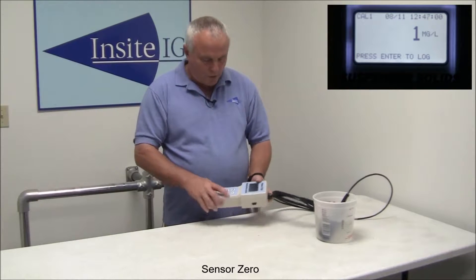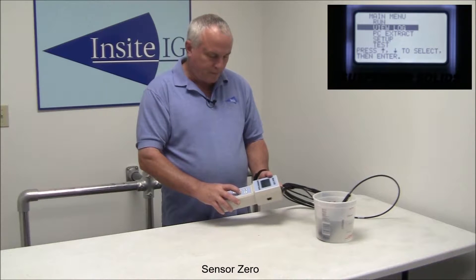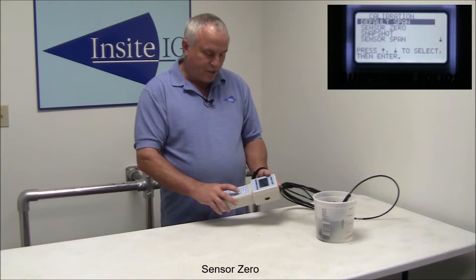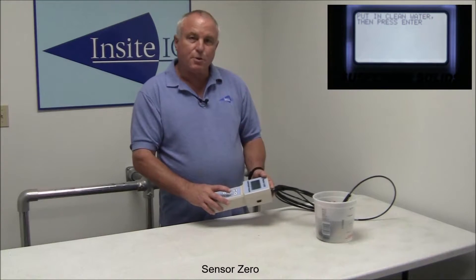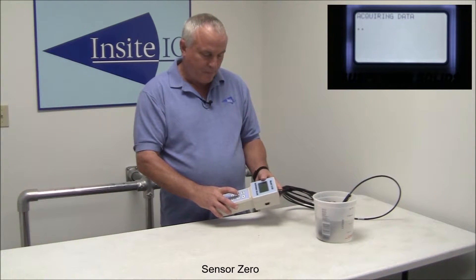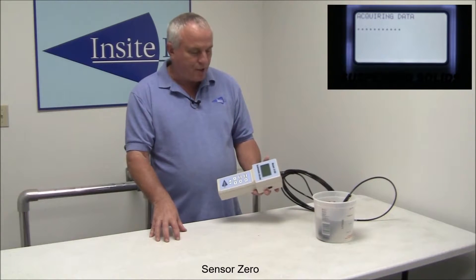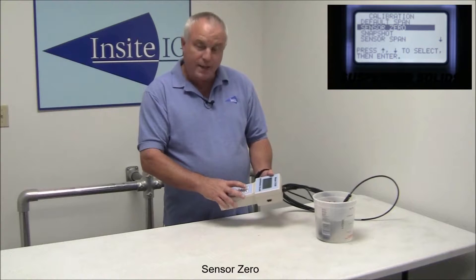Then with the unit on, just hit the menu button, scroll down to setup, press enter, scroll down to calibration, press enter, scroll down to sensor zero, press enter. It's going to come up with a message that says put the sensor in clean water, then press enter. We're already in clean water, so you press enter. It's going to say acquiring data, and this is going to take approximately 15 seconds. What it's doing is taking a whole bunch of samples and averaging them together so you get a nice clean signal. Then it's stored to zero. That's all there is to doing the zero.